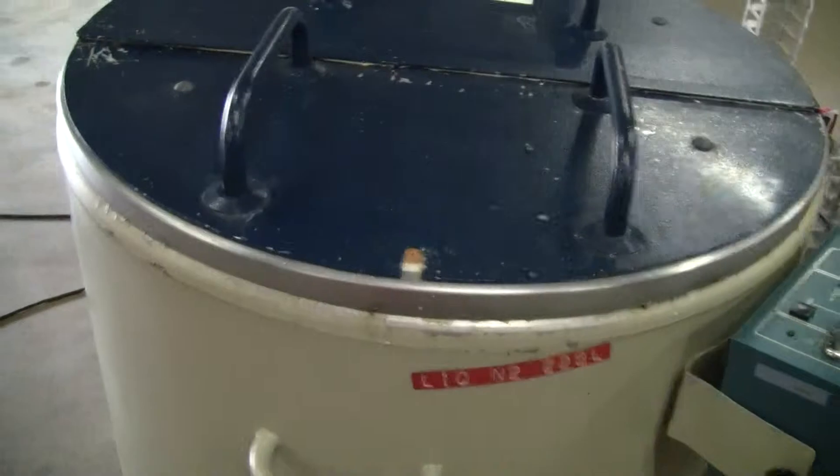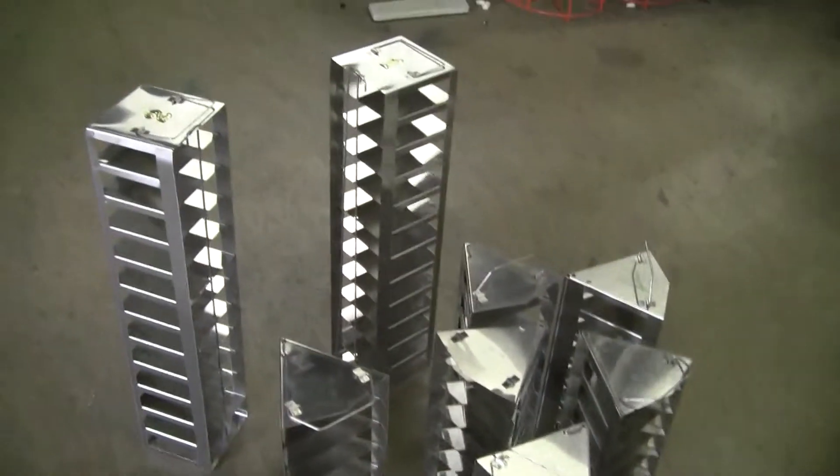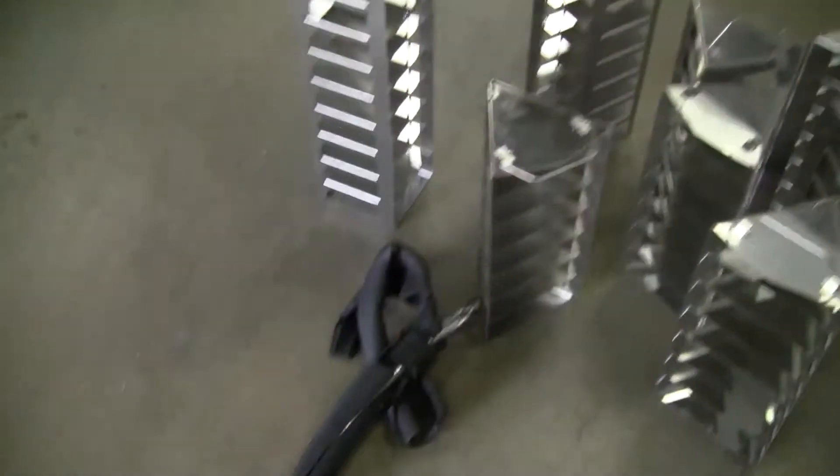There are a few things that weren't shown in the picture that I wanted to let you know about. I have the storage racks inside. It has a tube, I assume for feeding. And it has an alarm.